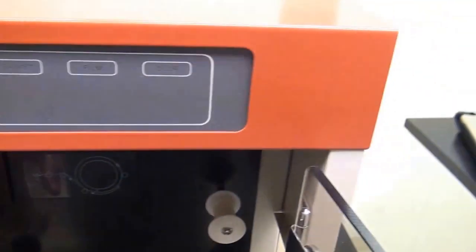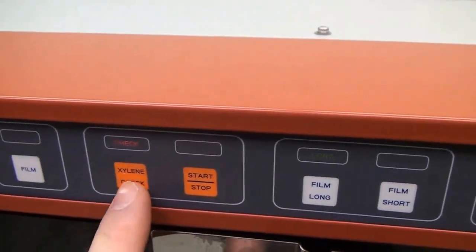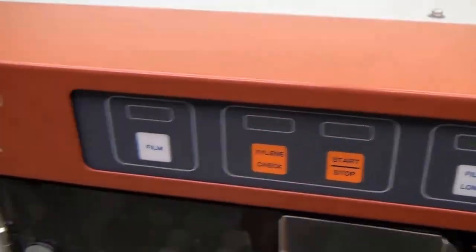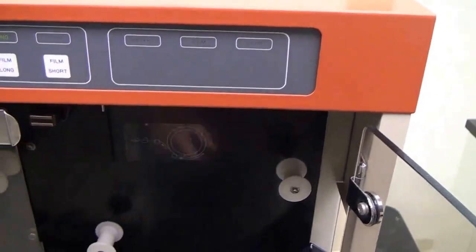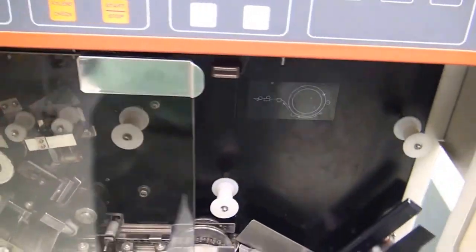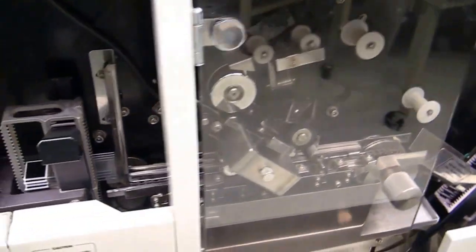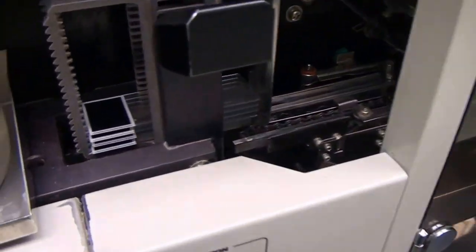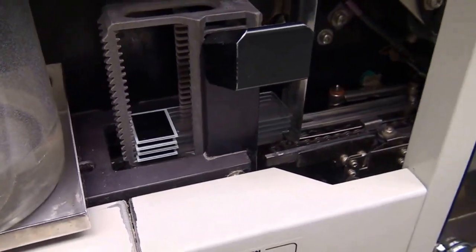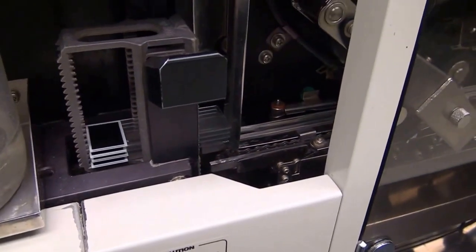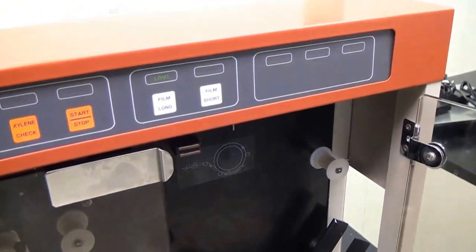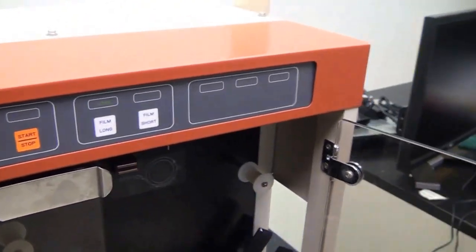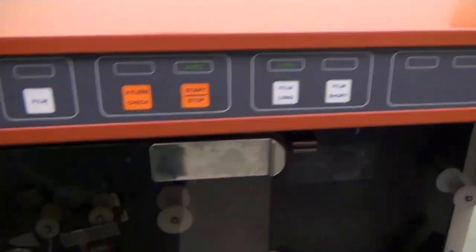We're going to close the door to get rid of our door light there. We're going to push the Xylene button. We do have some in there. We're going to leave this door open just so that we can show you the video easier. We only have four slides in this basket so it's not going to be a real big show, but enough just to show you how it works. So we'll go ahead and hit the start button here.